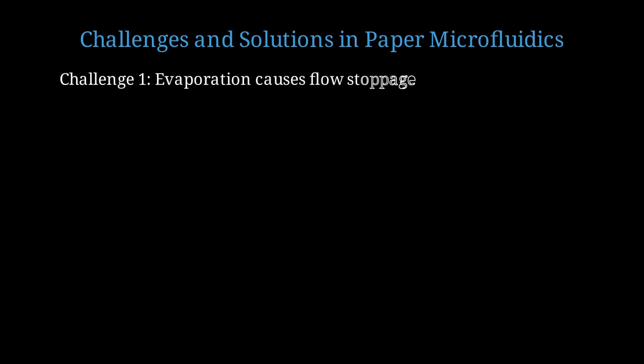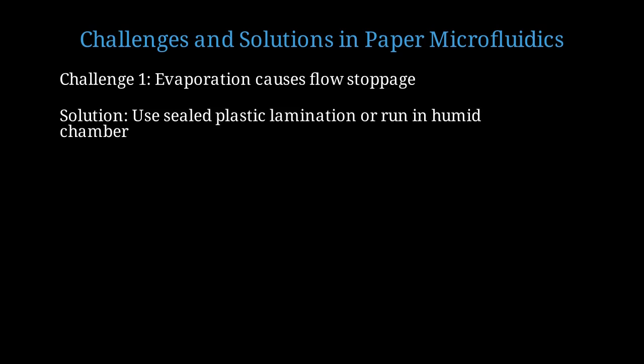Let's address some key challenges in this field and their solutions. Challenge 1. Evaporation. Paper channels have large surface area to volume ratios, so water evaporates quickly in dry environments. Solution. Laminate the device with plastic tape to seal the top and bottom, or conduct tests in a humid environment. This extends working time from minutes to hours.